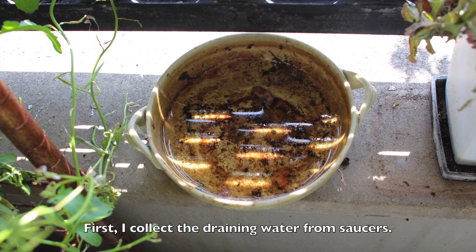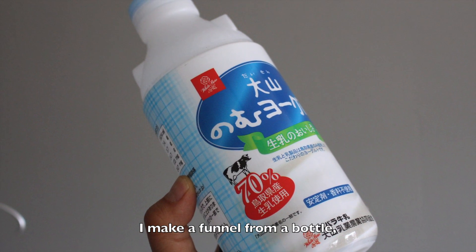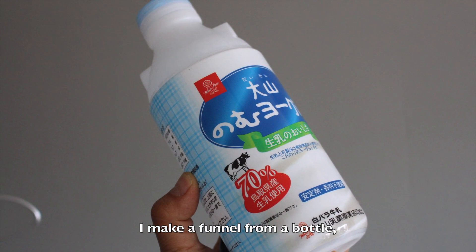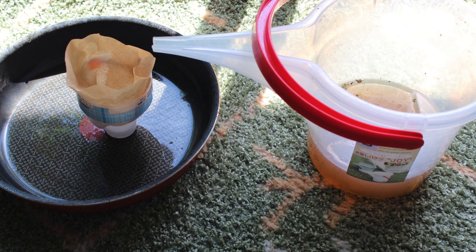First, I collect the draining water from saucers. I make a funnel from a bottle, then filter the water with a coffee filter.